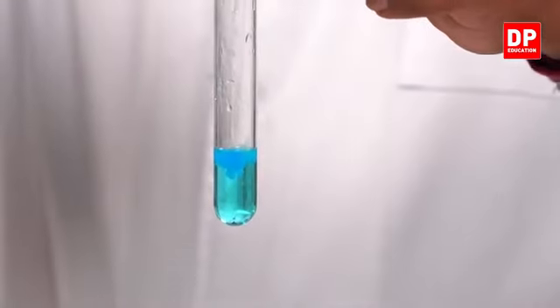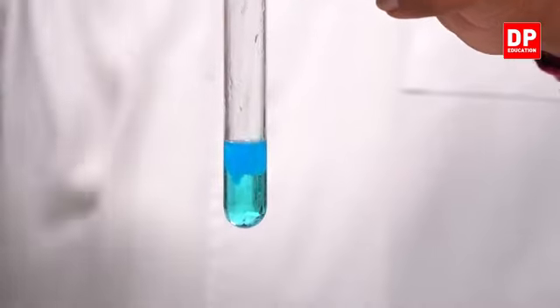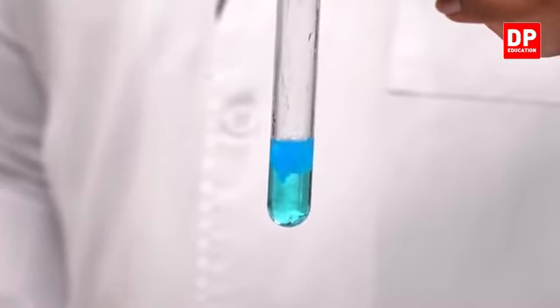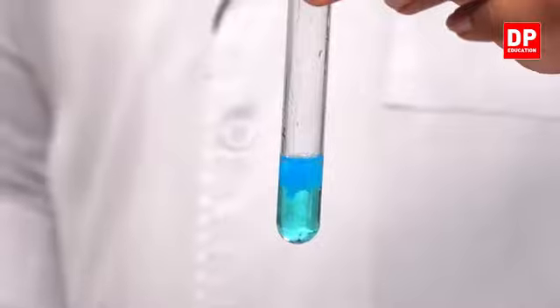So I'll add some more. Now you can see it clearly, right? It's very clear to us. There is a light blue color, not that much darker blue, but somewhat of a light blue color precipitation.